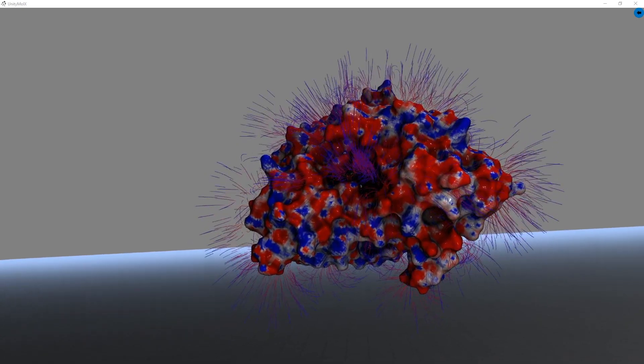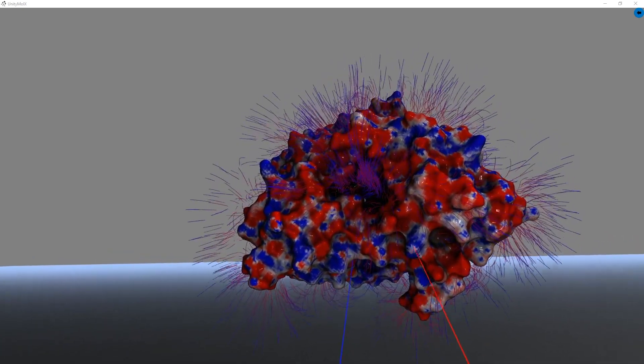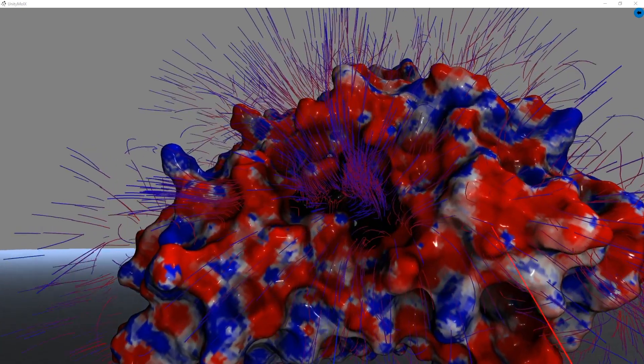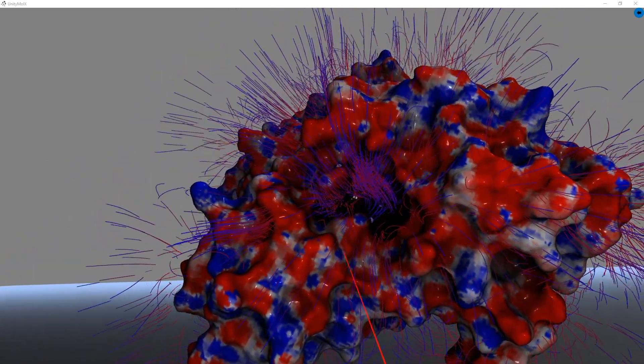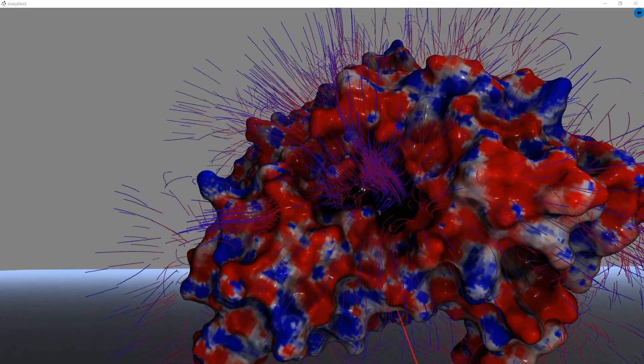Here we can see the entrance of the catalytic gorge. Let's take a second and blow the structure up. When we do that, we can see that the electrostatic gradient is pouring from the inside of the enzyme out into the solvent.